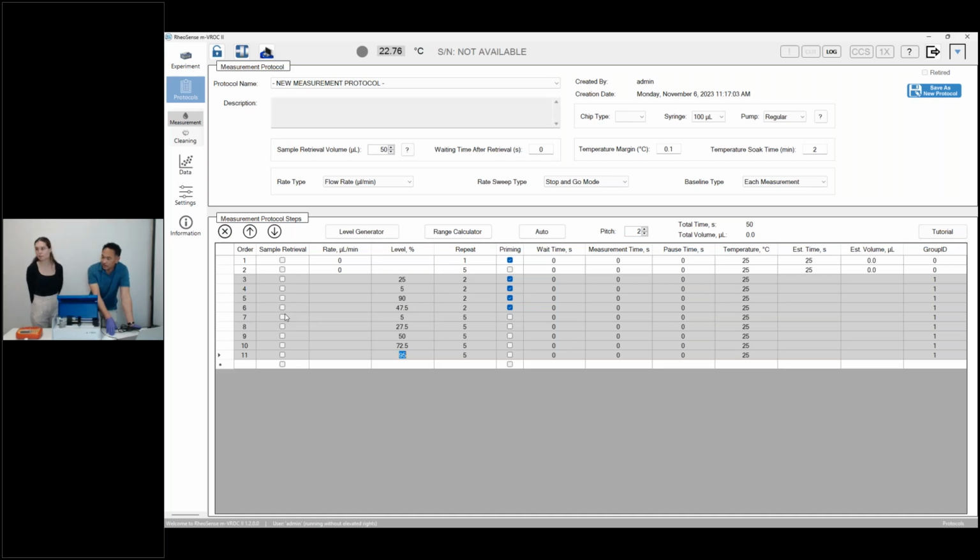I think our second question was just if it's 21 CFR compliant. It is, so you answered that on your first question. The VROC I and the MicroVis are not 21 CFR compliant, whereas the VROC II and our Initium 1 Plus automatic viscometer are.